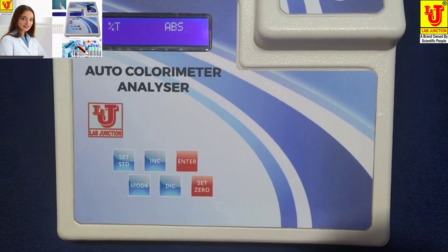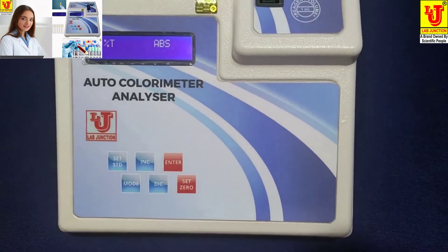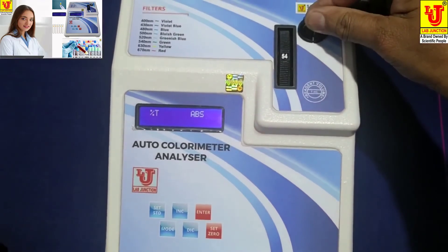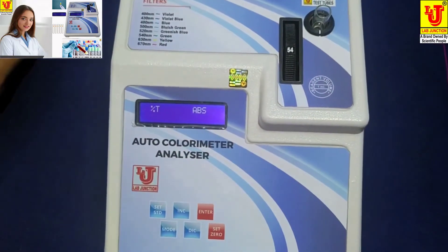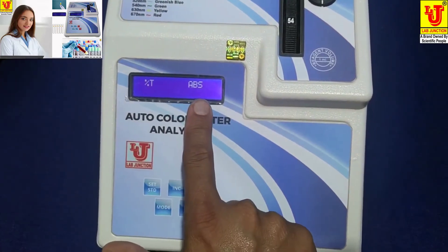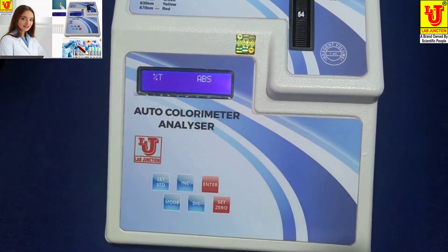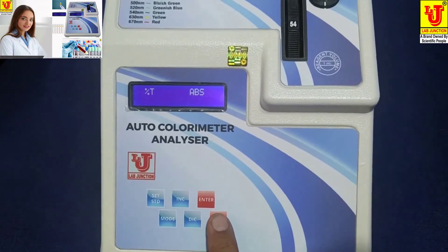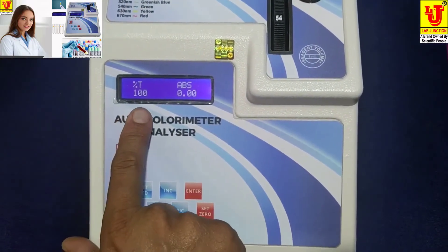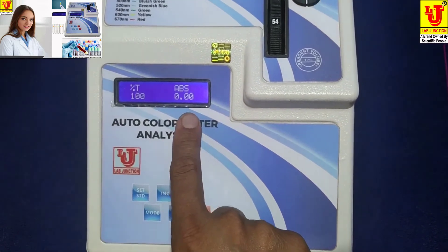Now I am inserting the blank in the test tube holder. The display shows percentage transmission and absorbance. If you press Set 0, then transmission of blank is 100% and absorbance is 0.